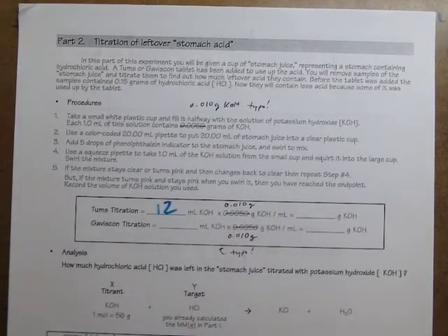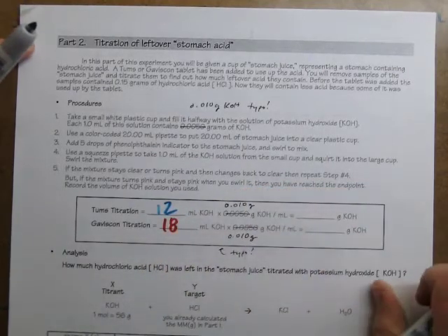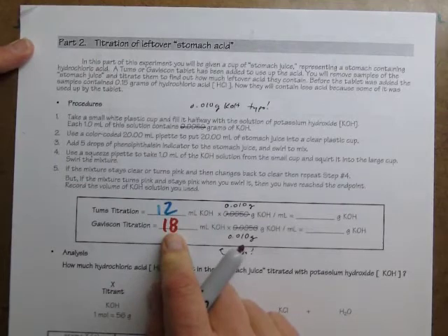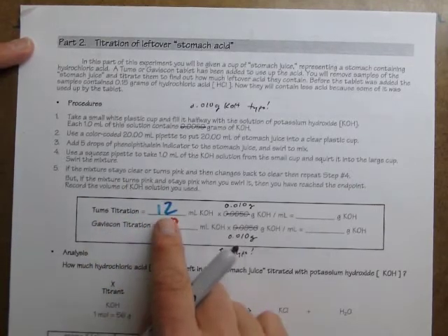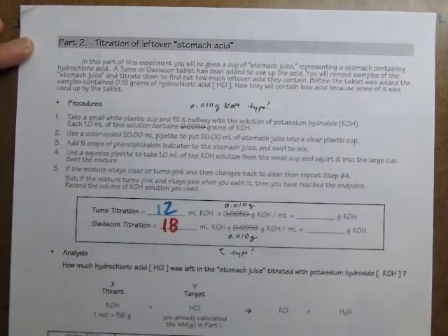When I did the analysis for the Gaviscon, it took 18 milliliters of potassium hydroxide. It took more because there was more acid left behind, because the Gaviscon didn't use up as much acid as the Tums did. It took less potassium hydroxide to use up all of the remaining acid because the Tums had used up more of the acid, so there was less left to titrate.